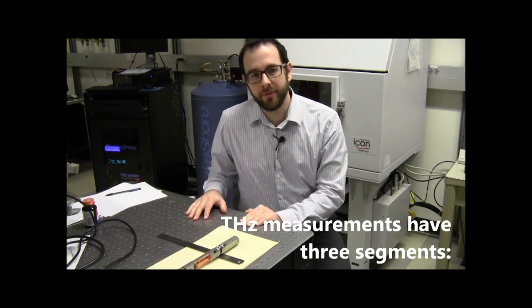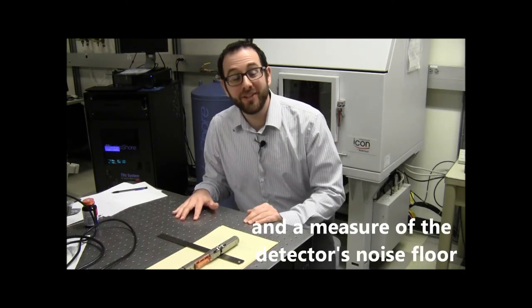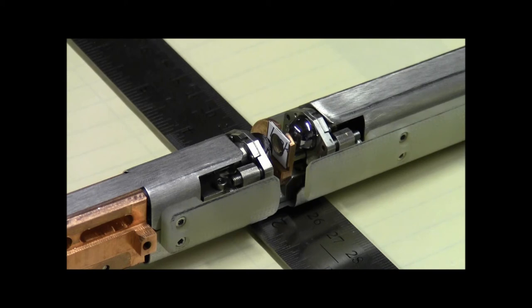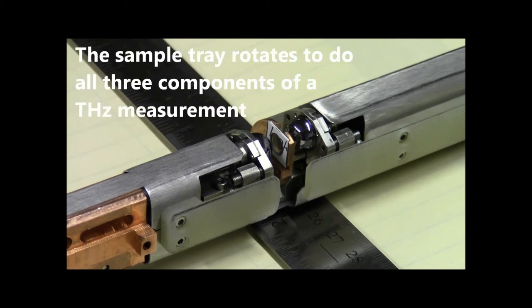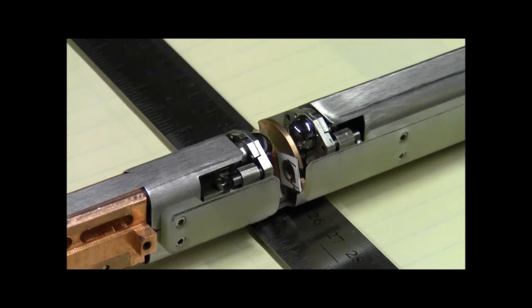Terahertz frequency transmission measurements consist of three segments: transmission through the sample, a reference measurement without the sample, and a measure of the detector's noise floor. What we've designed into our system is the ability to rotate the sample tray. You're able to take a sample measurement, rotate the tray, take a reference measurement without a sample between the emitter and detector, and then block the transmission between the emitter and detector to get a measure of the noise level of your detector.